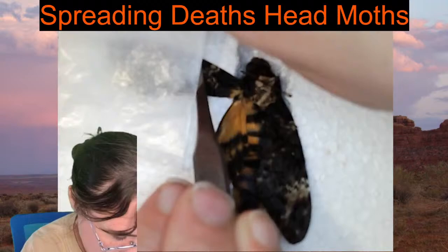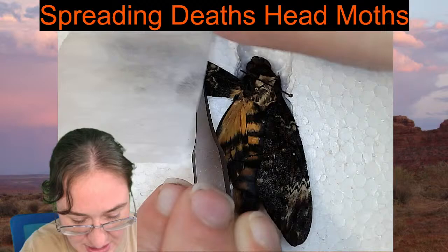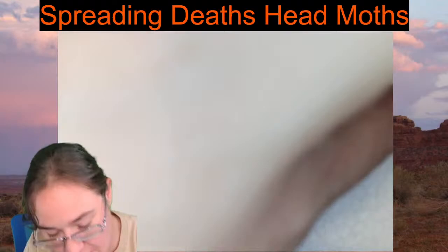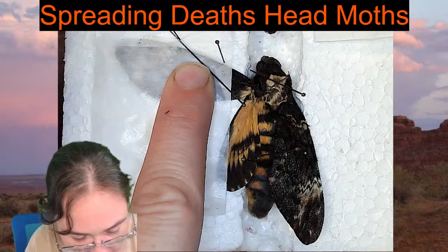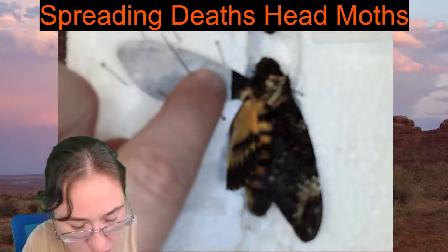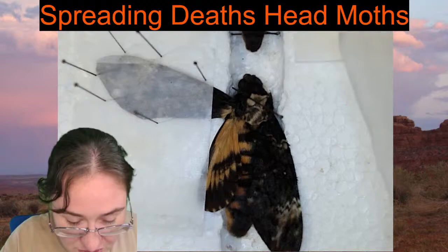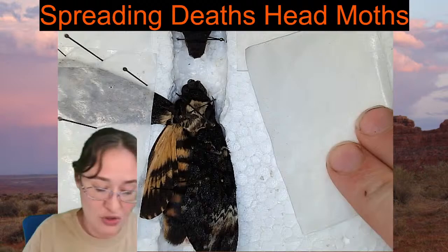All right, so what I'm going to do is take this piece here and hold down, and then I can take pins and go all the way around the wing. I think this one might actually have to go a little bit higher, but I want to get the wing at least open and spread, and then once the other one comes up, that might be pretty close. So instead of putting pins on this side, I'm just going to set it here so that it's where I need it, but it's not going to interfere with the pins. I'm coming in.